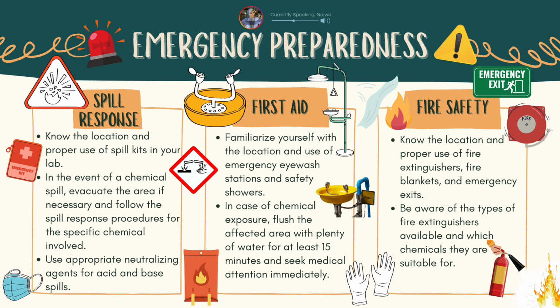Secondly, first aid. We need to familiarize ourselves with the location and use of emergency eye wash stations and safety showers. In case of chemical exposure, flush the affected area with plenty of water for at least 15 minutes and seek medical attention immediately.